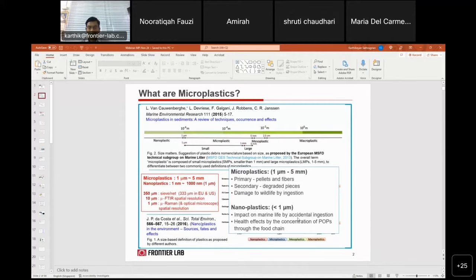So microplastics are plastic particles that are 5 mm and less in size. It can be diameter size, or for fibers, it can be in terms of the length. The size classification starts from macroplastic, mesoplastic, microplastic, and even nanoplastics. In terms of toxicity and impact on human health, people have started looking into nanoplastic, but it's far ahead for us to have a better understanding of this. Today, at least, we have a very good understanding of microplastic.